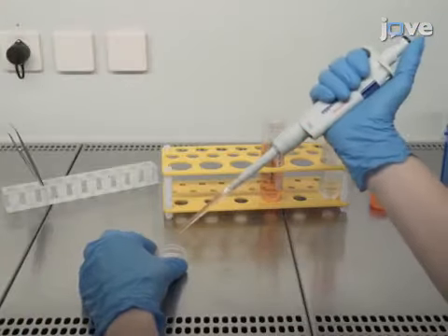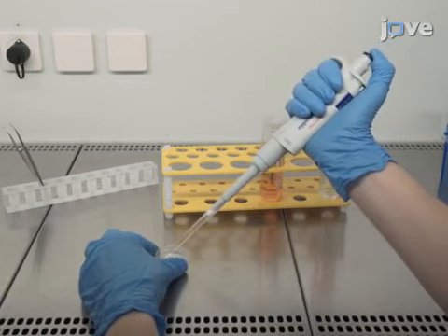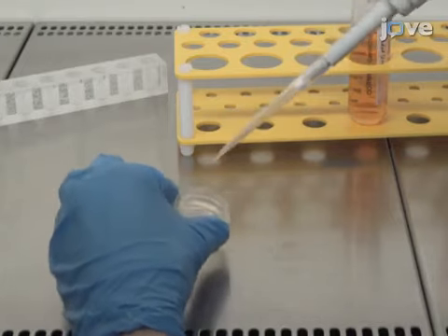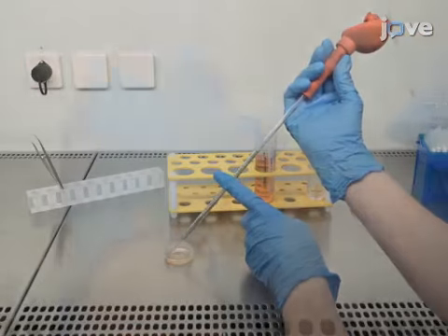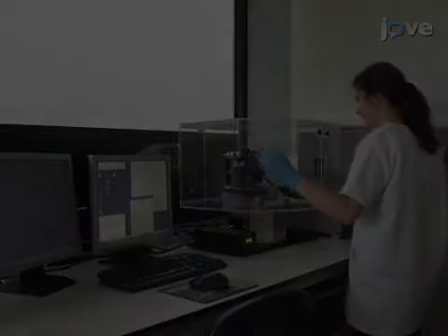Wash the culture 1 to 2 times with 1 milliliter of HEPES-buffered cell culture medium to remove any dead cells and remaining cellular components from the wound area. Then, add 2 milliliters of fresh HEPES-buffered medium and close the dish. Now, place a petri dish.